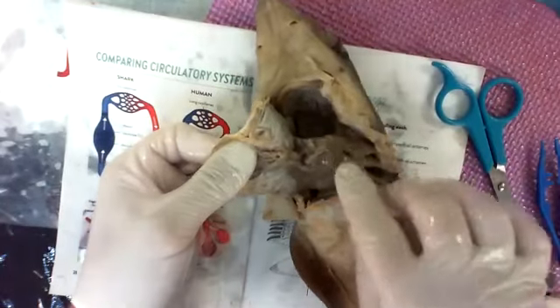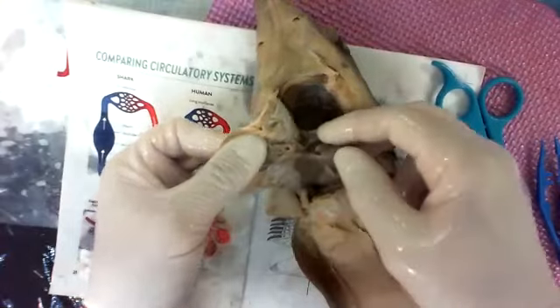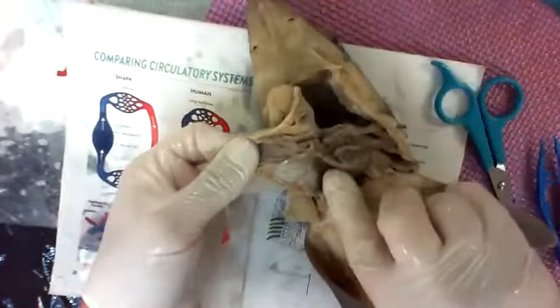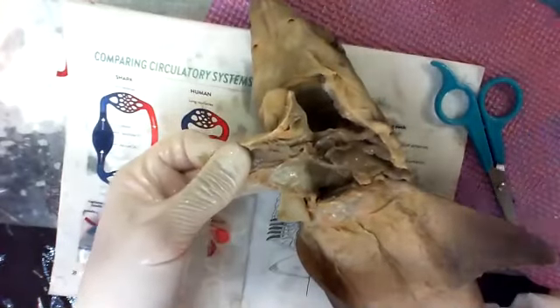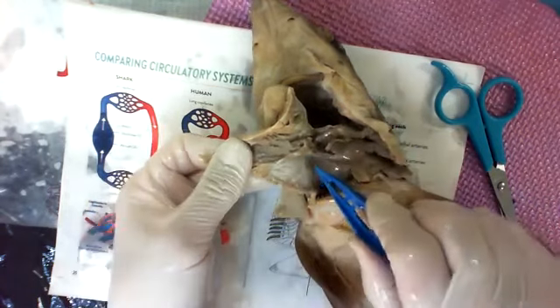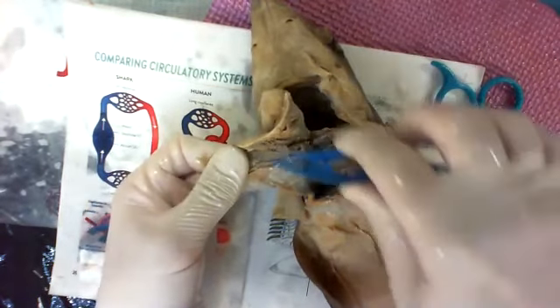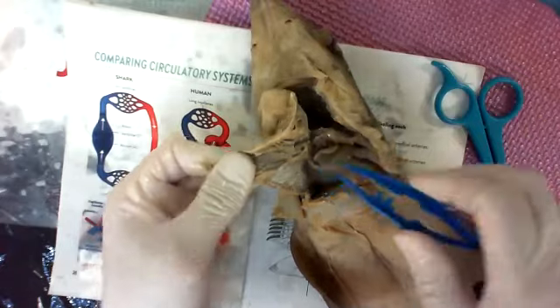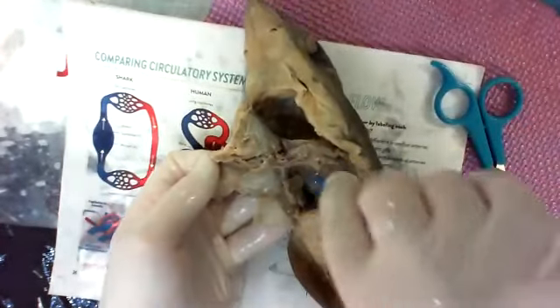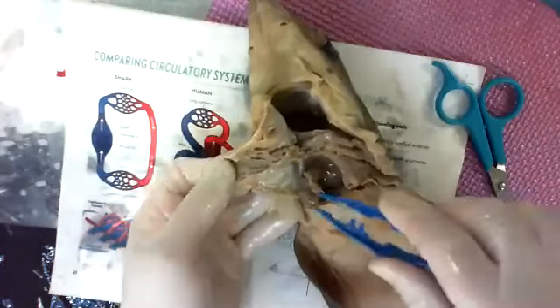Right. So now, heart's still connected. Here's the big blood vessel coming out. So that's the conus arteriosus right there. This goes into one of the most famous blood vessels in the body. It's called an aorta. Right. So this aorta is actually sitting close to the front. So we're going to give it another name. It's called the ventral aorta because it's technically on the ventral side. And there's another aorta that runs on the back called the dorsal aorta.